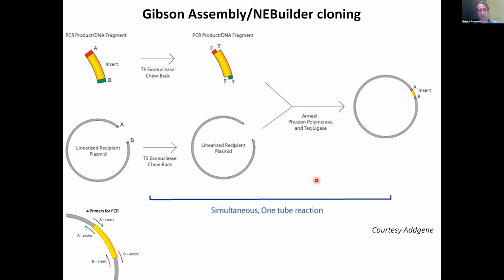There's actually another trick here which can make this even easier. Still, this procedure relies on having restriction enzyme sites A and B to cut open your plasmid. However, often these days, you can get rid of that step by taking a plasmid and doing a circular PCR reaction.